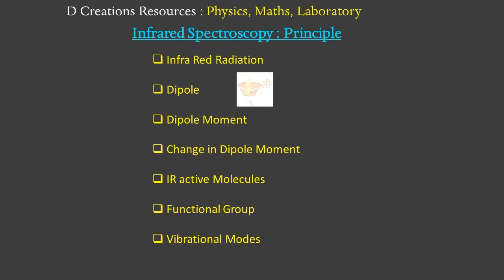We are looking at different aspects of spectroscopy, and today let us talk about the principle of infrared spectroscopy or IR spectroscopy. Now, infrared or IR, as it is referred to, is basically an electromagnetic radiation with its wavelength regime between around 780 nanometer to around 1 millimeter.